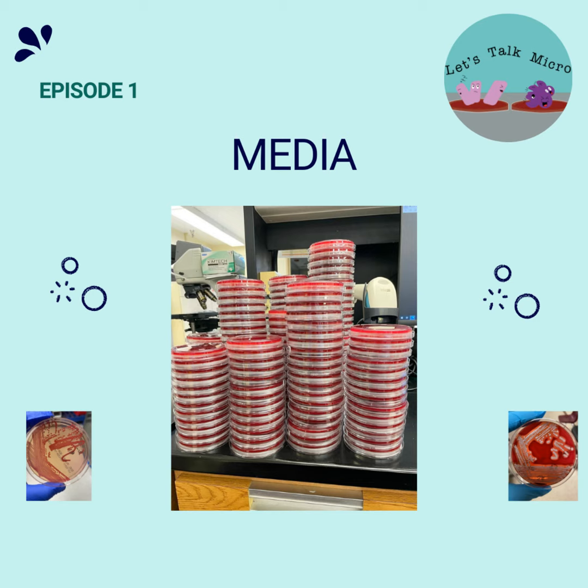So your isolation, right? Basically, you do the 4 quadrant streak. So you see your plate, imagine it divided in four. With your swab, you inoculate your first quadrant. You add that drop of your fluids.